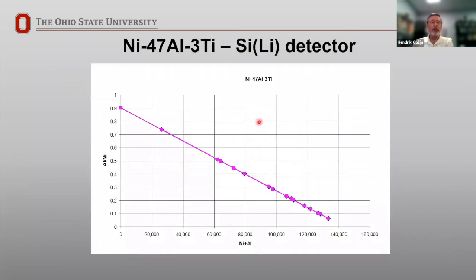Now, here is an example taken on an old detector of a nickel aluminide sample. And this is really a pathologically bad case. The aluminum signal is very, very strongly absorbed. So you are out of the thin film criterion very quickly. So this is going thicker and thicker into my sample, and you can see how the aluminum to nickel ratio drops off very quickly. So you can calibrate this to thickness if you need to.